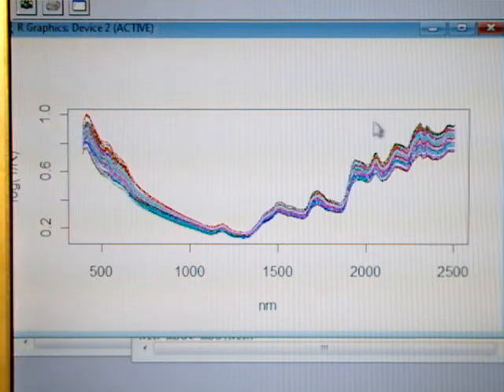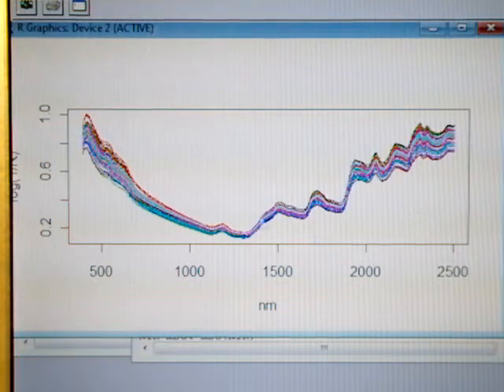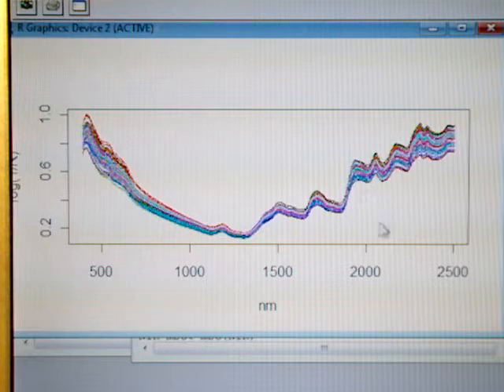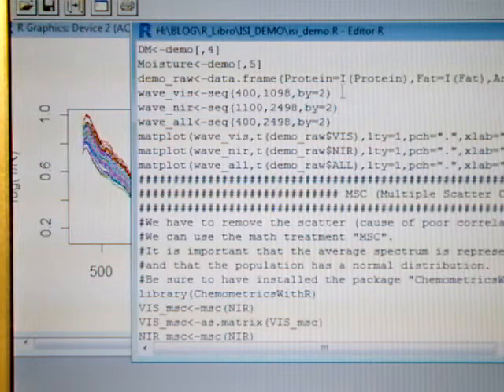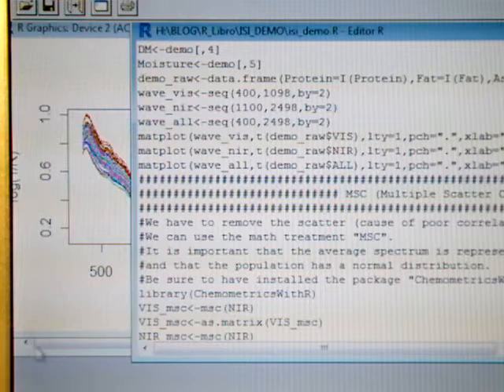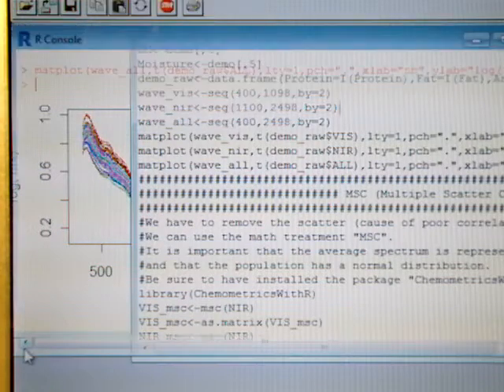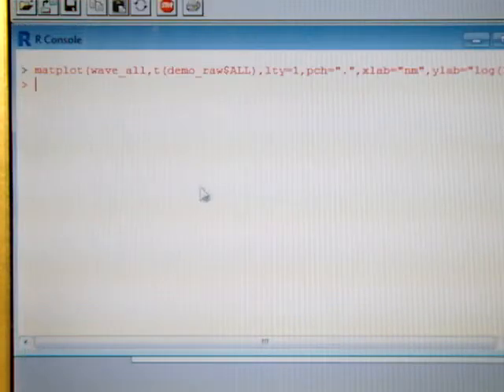We have seen in other videos this spectra treated with different math treatments, but now what we are going to see is the constituents values.